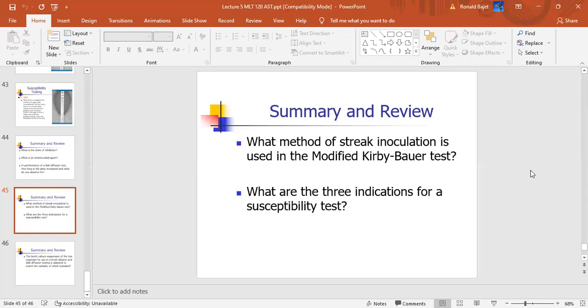And in each pair, you will streak for isolation, Staph aureus, and Pseudomonas aeruginosa. Okay. And then we'll do colony observation tomorrow. And that's it for lab. So take one MacConkey, take one blood, and scrape for isolation. Organisms are right here. All right.